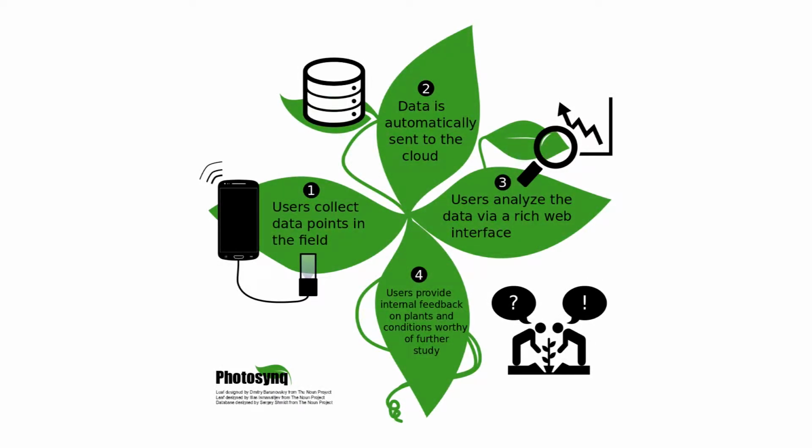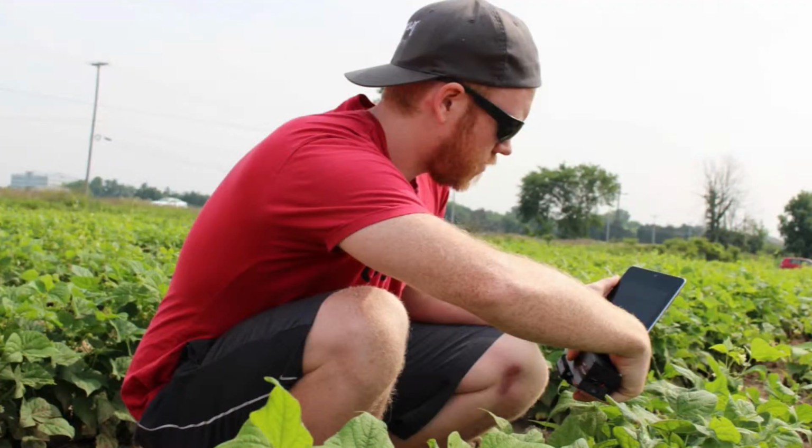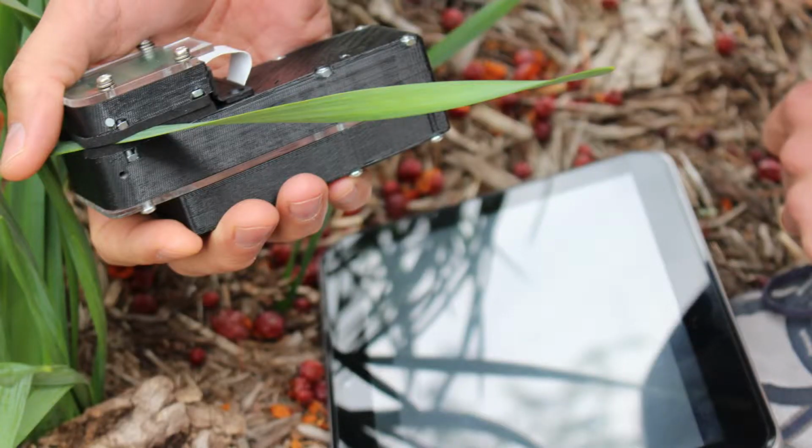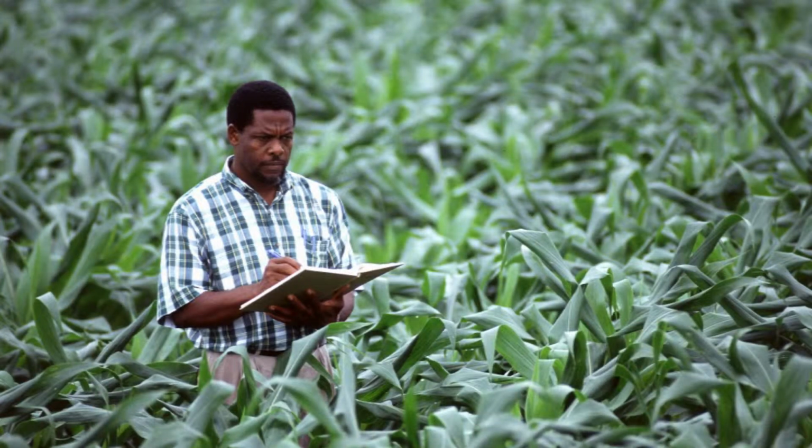You start on the website, you create a project. Within the context of that project, you define the measurements that will be taken. And then someone who has their cell phone sees your project, right? And they say, oh yeah, I want to find the most photosynthetically efficient algae, for example. So they take part. They follow your directions. They take a sample according to your protocols, and then the data goes back to you. So the idea is that ideas go out and data comes back.